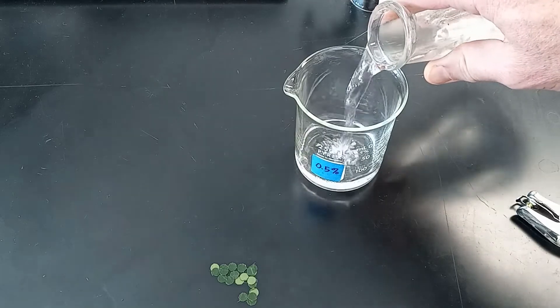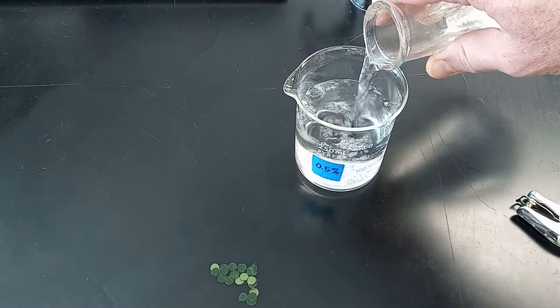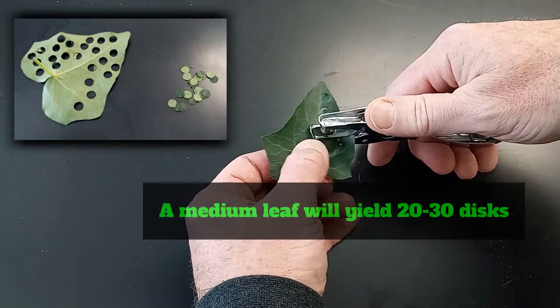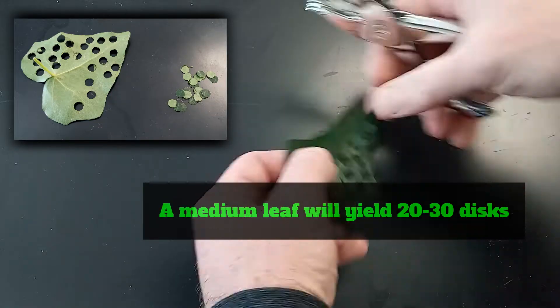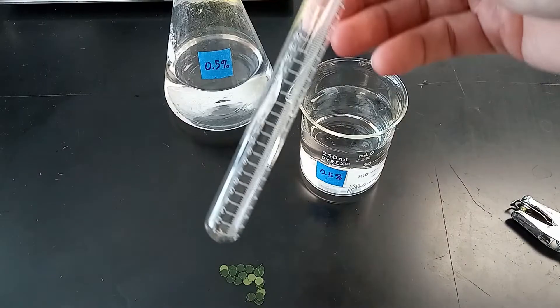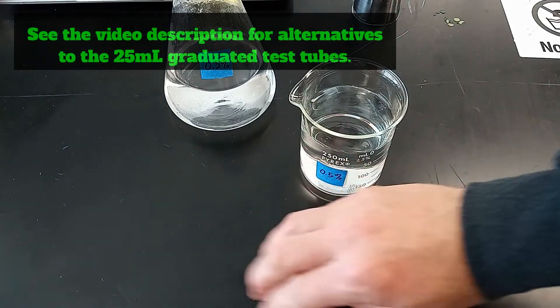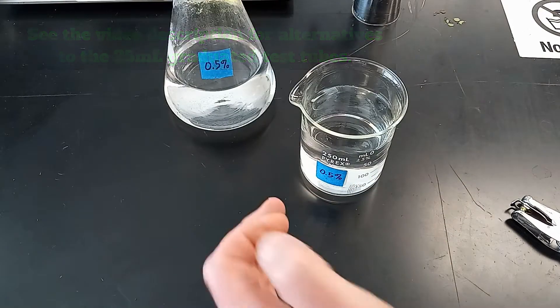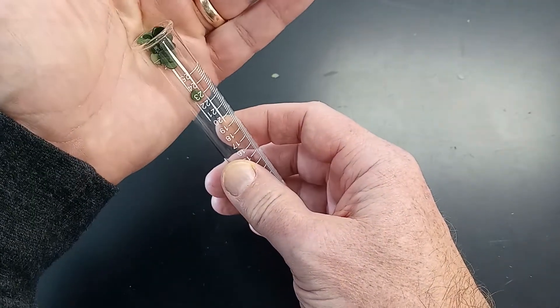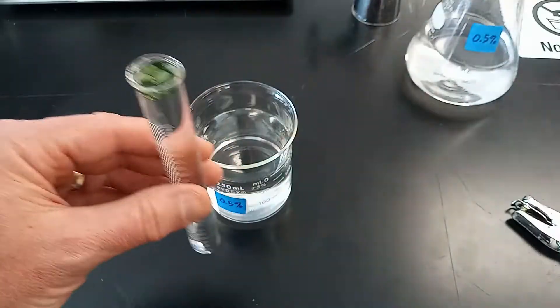We will start the experiment by pouring about 200 milliliters of water into a 250 milliliter beaker. To set up one of the experimental test tubes, I punched out 20 disks from an ivy leaf using a hole punch. These will be transferred into a 25 milliliter graduated test tube. The easiest way to transfer the leaf disks is to hold them in the palm of a cupped hand and scoop them with the test tube. The next step is to pour liquid into the test tube, filling it to the top.